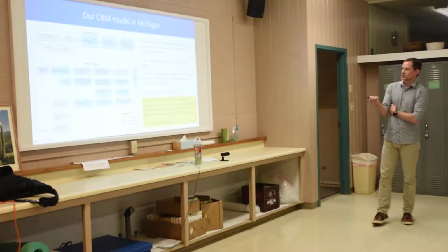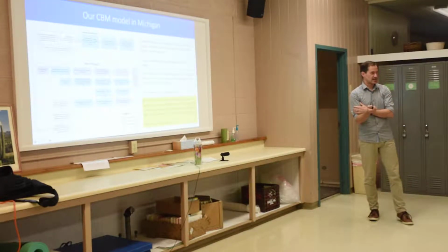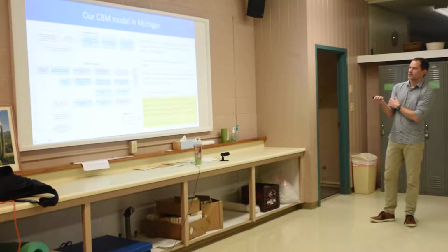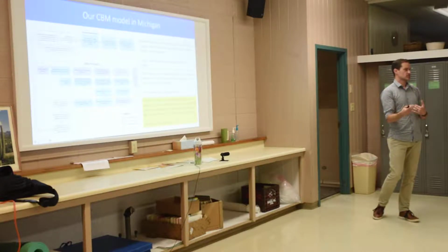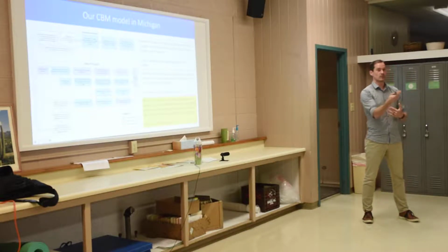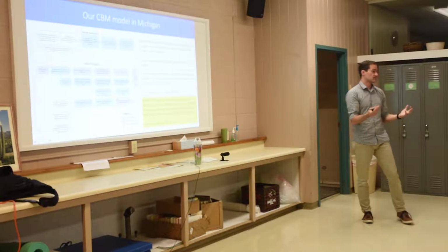The blue sections are completed by the central labs, which could be my lab or it could be Freshwater Solutions lab. We kind of view them as a quality control lab. And so these sections are where we have things happening where we are quality controlling the samples. So we make sure that, for example, 10% of the samples run by a CBM partner might be run at a QC lab, so we can make sure that we're getting the same results. So we can do sort of a results validation.